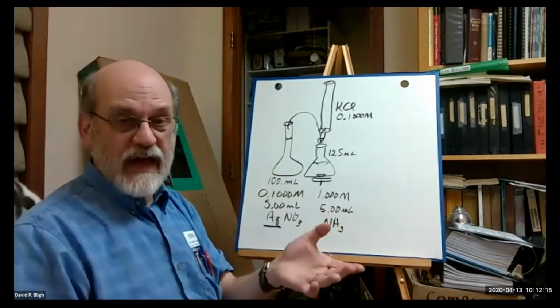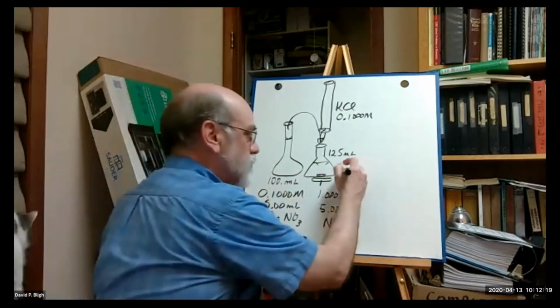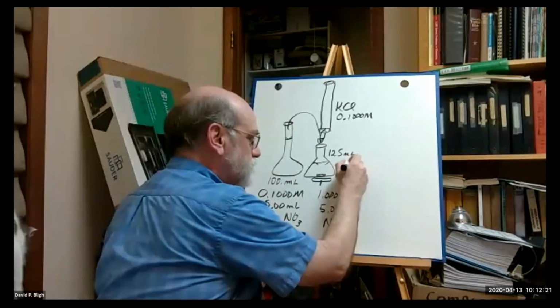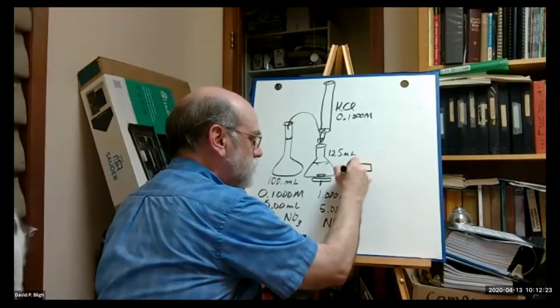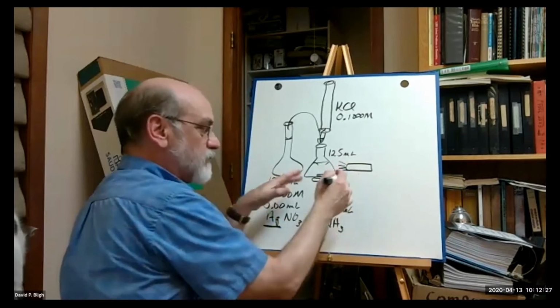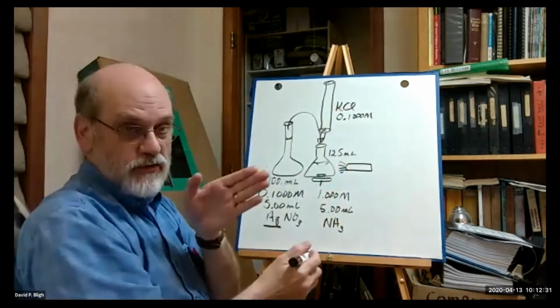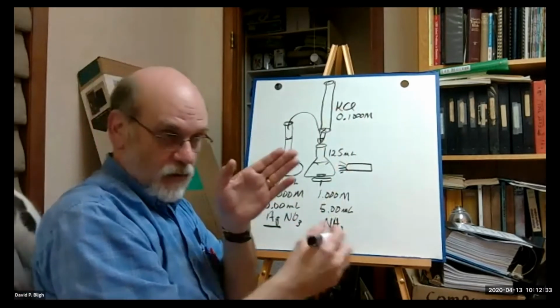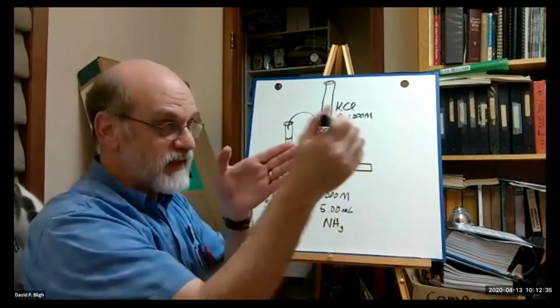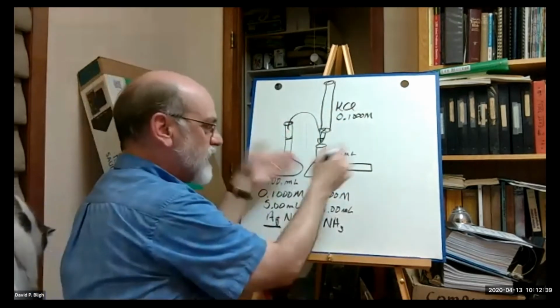With suspended solids or colloids, the Tyndall effect is such that you shine a light, right? And that light beam shines at right angles to your eye through the solution. When it's a solution, you don't see the beam in your flask, right? There's nothing there.